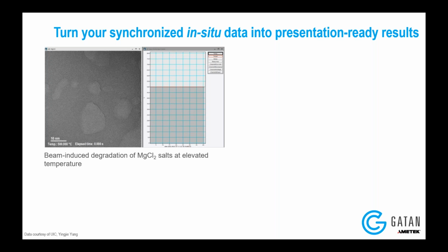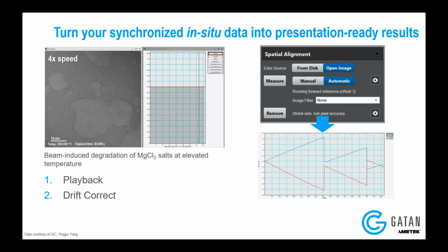So just to show a little more in depth how we would process this data, this is the same video. We could play it back. On the left is the video. On the right is the metadata that's being played back in a synchronized manner in DigitalMicrograph.